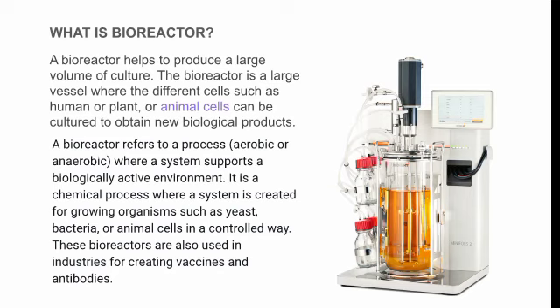So, what is a bioreactor? A bioreactor helps to produce a large volume of culture. The bioreactor is a large vessel where different cells, such as human, plant or animal cells, can be cultured to obtain new biological products. A bioreactor refers to a process, aerobic or anaerobic, aerobic in presence of oxygen, anaerobic in absence of oxygen, where a system supports a biologically active environment.